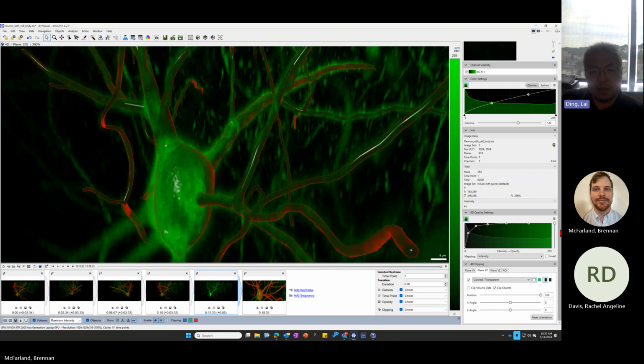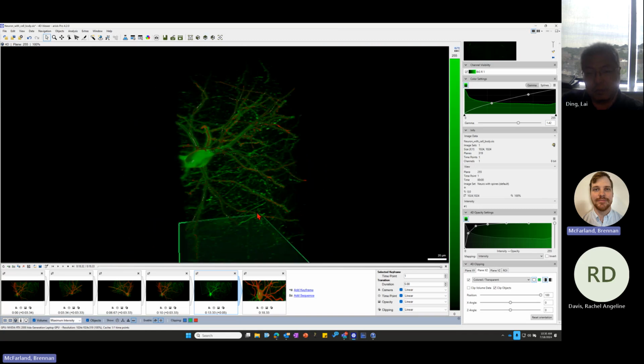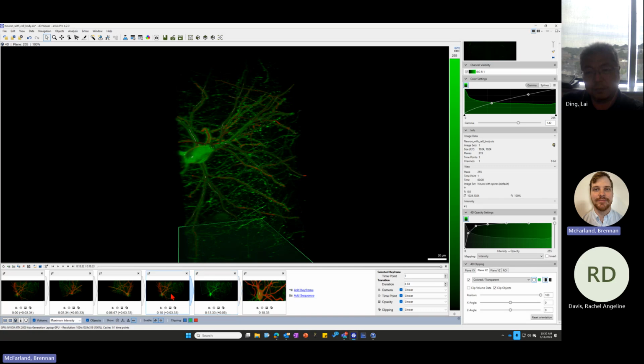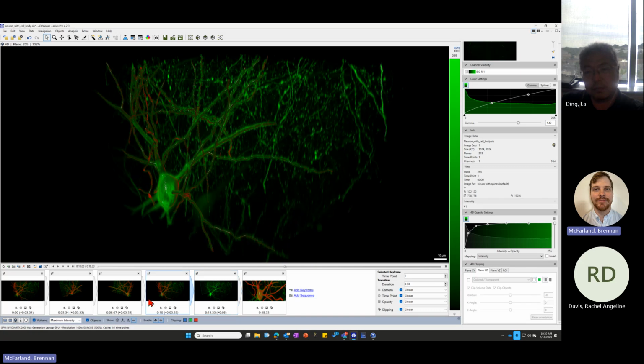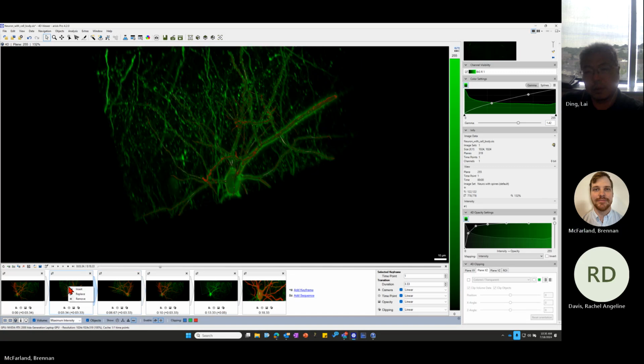So when you do the sequence, like do the rotation, the X, Y, Z are the universal frame axis, right? It's going to be showing whatever's in this viewer. In this case, it's 3D, so it'll have the Z data as well. These are just thumbnails, like snippets of where it's going to go, rather than screenshots. I don't think we would be able to extract.